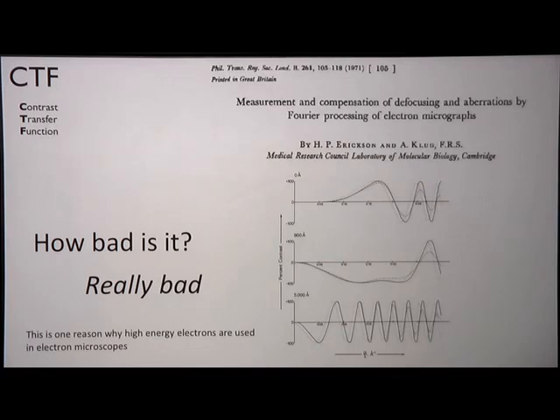So what I'd like to do is at least give you a sense of where these curves come from, these wiggly curves that Tony showed, and that you're going to spend a whole bunch of lectures figuring out how to compensate for later. But I want to give you a sense of where they actually come from. And they come from the lenses, the optics, right? A perfect optical system would not cause this.